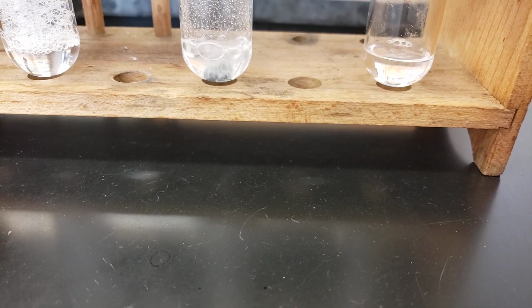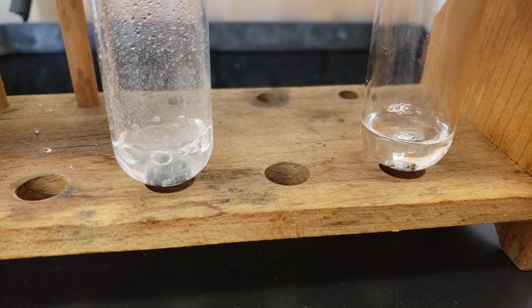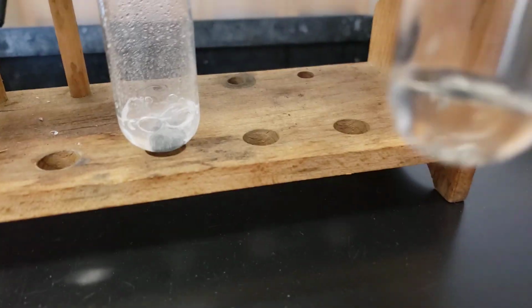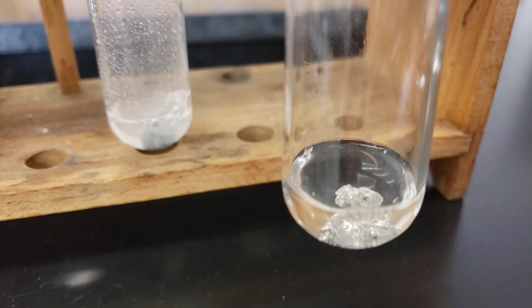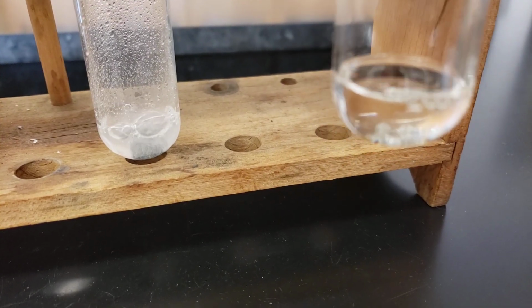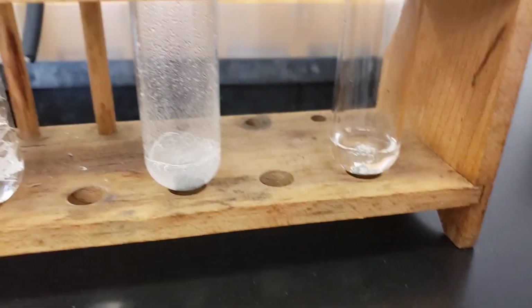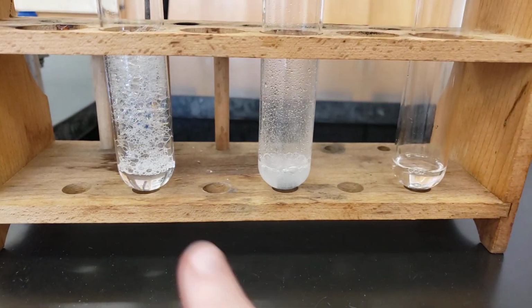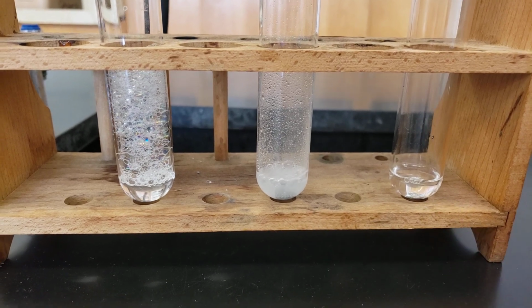Now, last but not least, we are going to take our tin and drop it in that hydrochloric acid. And much like the magnesium in our first trial, we see our tin in our hydrochloric acid is not doing much at all. It is basically just hanging out there, showing us that it is the least reactive. So you can once again compare the 3 reactions with magnesium, zinc, and tin.